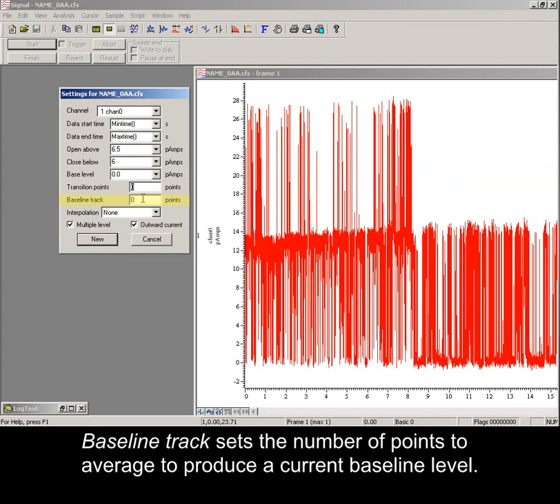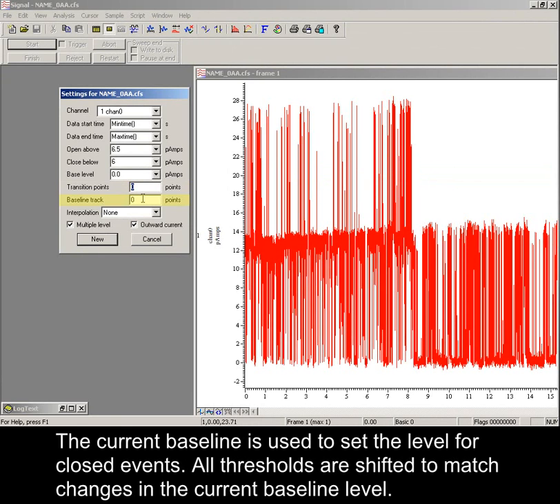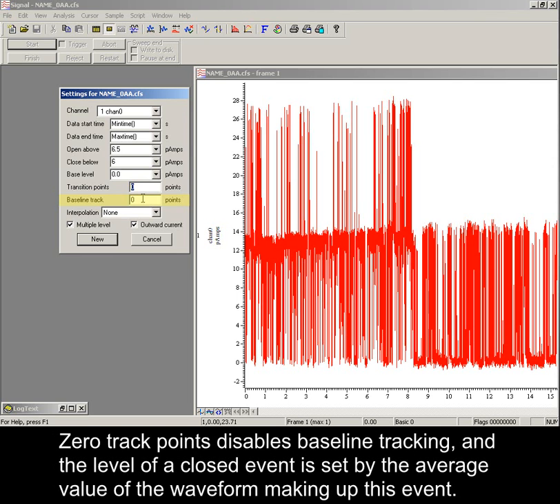Baseline track sets the number of points to average to produce a current baseline level. The current baseline is used to set the level for closed events. All thresholds are shifted to match changes in the current baseline level. Zero disables baseline tracking, in which case the level of a closed event is set by the average value of the waveform making up this event.